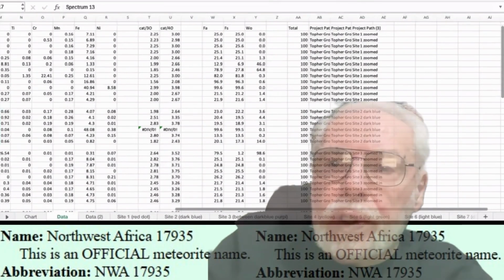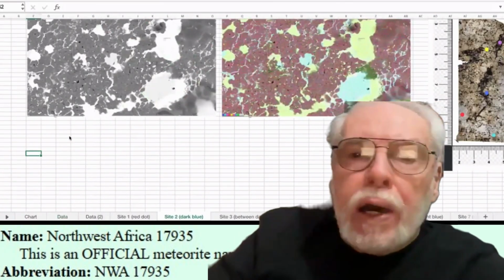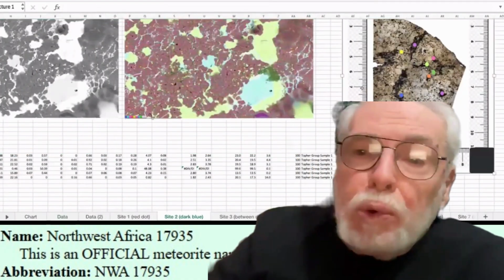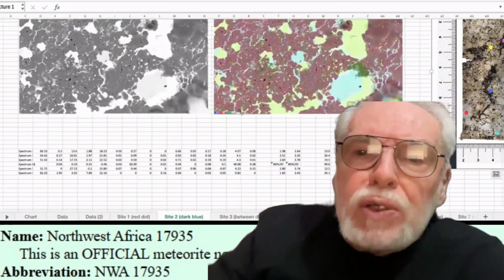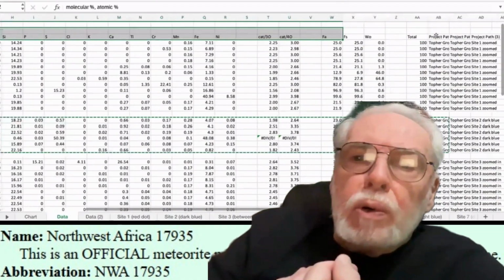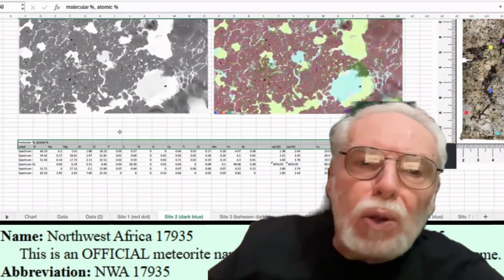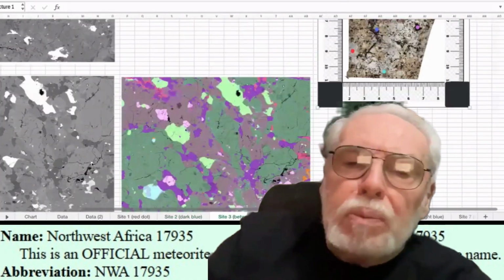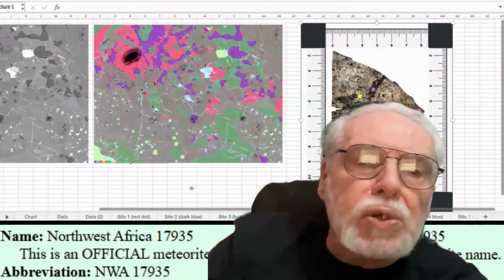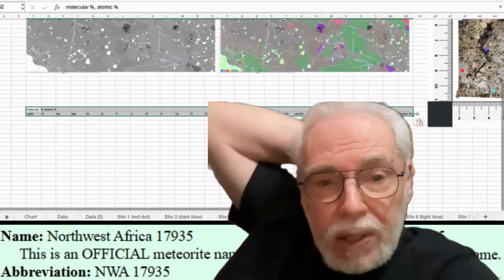When we were viewing the slices, it seemed like all the metal blobs were surrounded or bordered by what looked like alteration of possible metal sulfides or a different form of the iron, because the metal blobs, all of them, are super shiny, and it doesn't look like the shiny metal blob has been altered in any way, but all around the outside of it looks like alteration of metal sulfides or different iron in there in the slice.